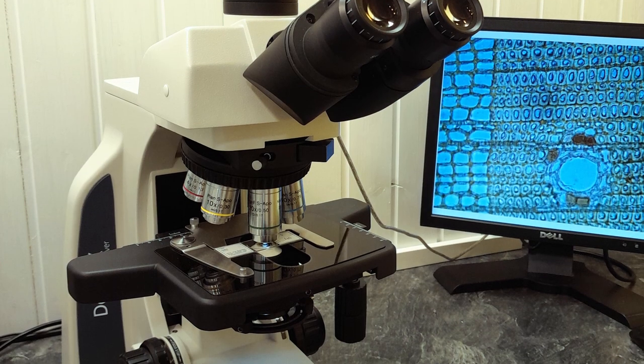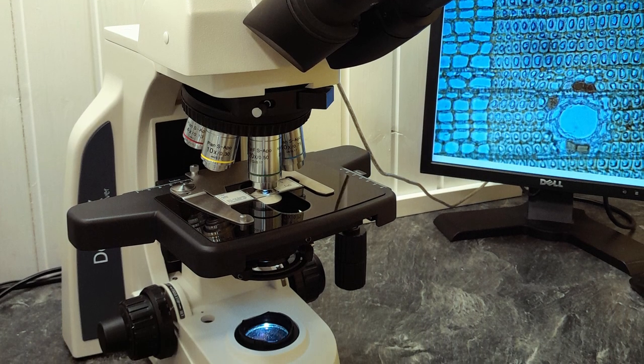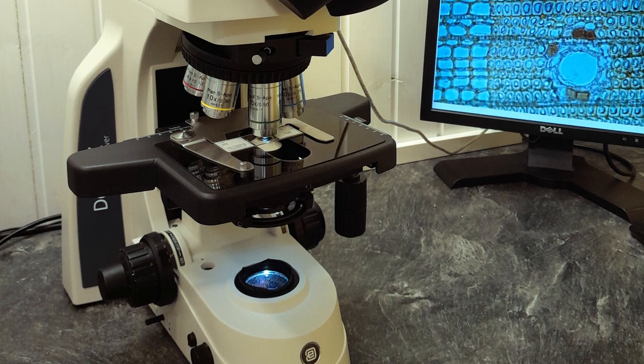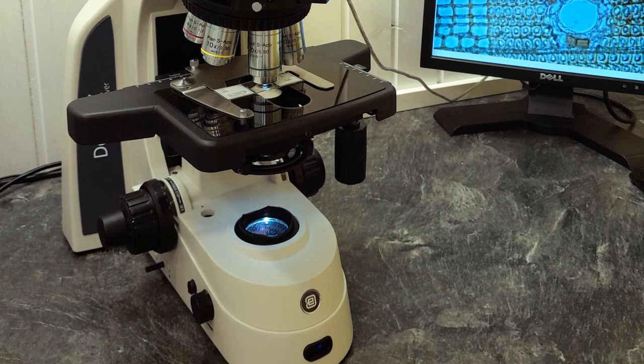The Delphi X Observer here is, as you can see, a fairly large device. I would say a research grade microscope. But I'm quite sure that many of you who are also involved in amateur and hobby microscopy are going to find this microscope very interesting because it does have some interesting features that you cannot find on other microscopes as well.